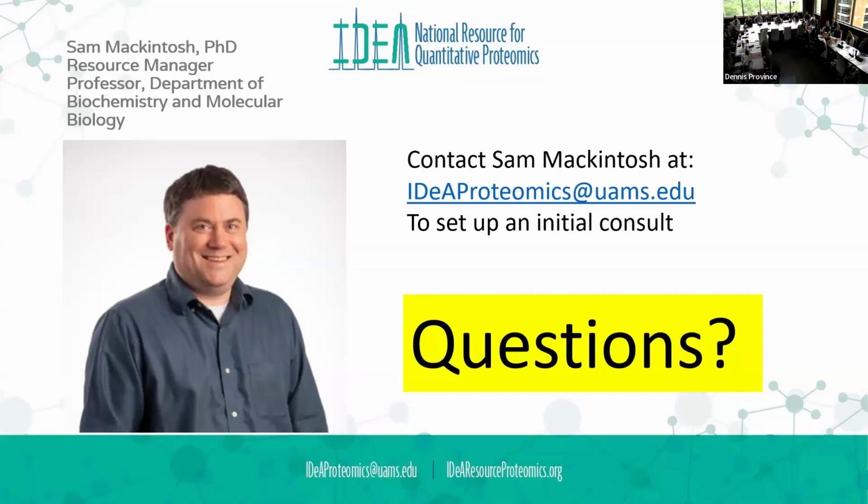And then when we do the search, we can just tell the data searching software that we have a different enzyme. But sometimes we'll buy that and do the digest here. And we can also send you protocols, like the protocol that we would use to do the protein purification and things like that before you do the digest.